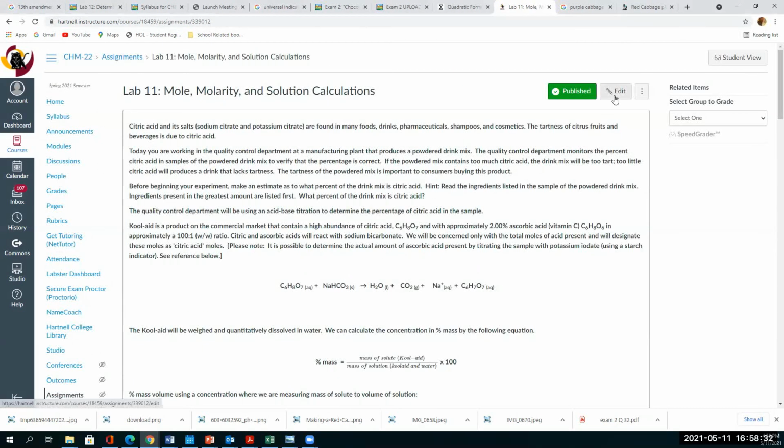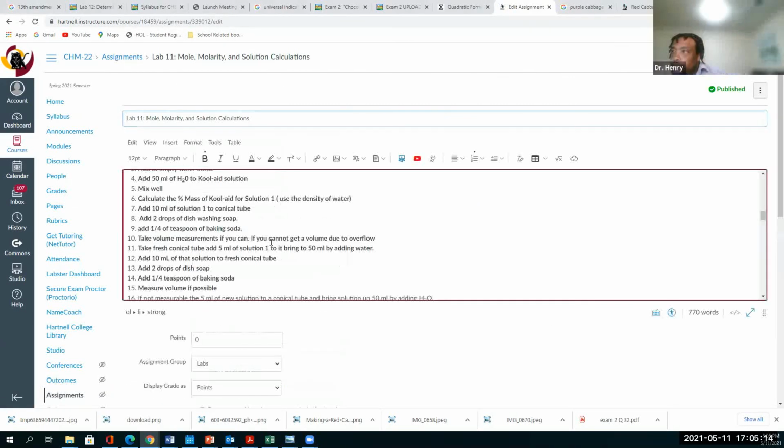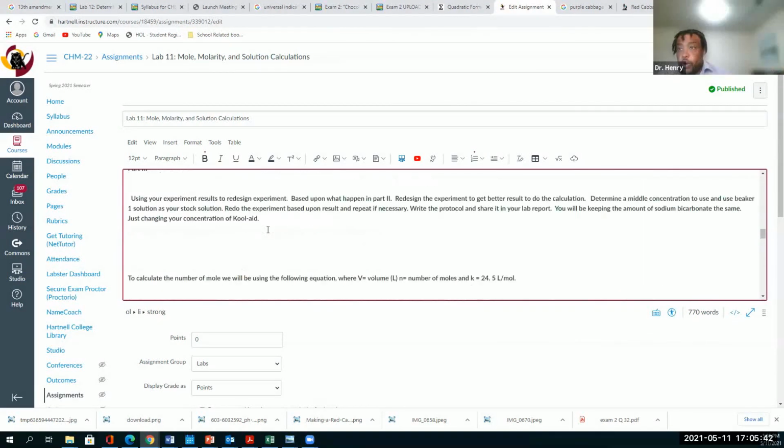When it says beaker 1, does it mean solution 1? Yes. So I poured the Kool-Aid, and it stayed pinkish, a reddish color. So the Kool-Aid was pink, and then it went to red. Okay. Is it vinegar? Is it vinegar?